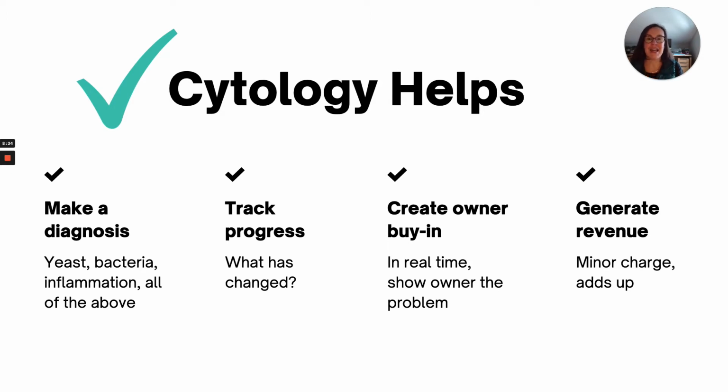I get that. However, collecting cytology isn't something that you need to charge for. So I usually will, as I'm doing my exam, collect my cytology samples and then have them available to go look at once I get a better sense of what is going on with this patient and with the owner as well. So you could just have the samples ready to go, do them as you do your exam, and then say, I would like to look at these slides so that I can make sure your dog gets the best treatment.